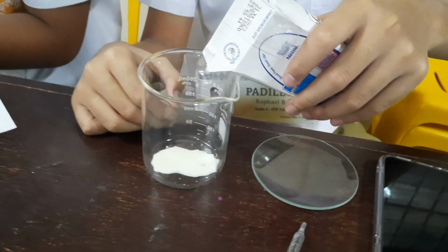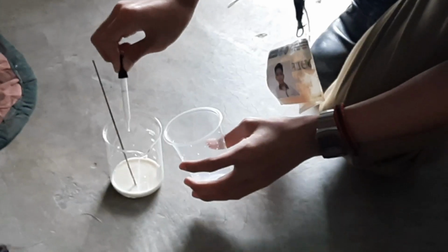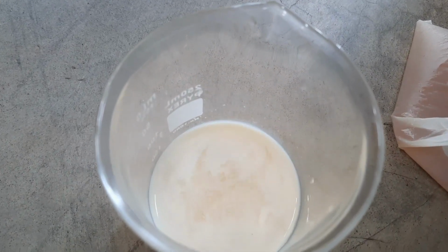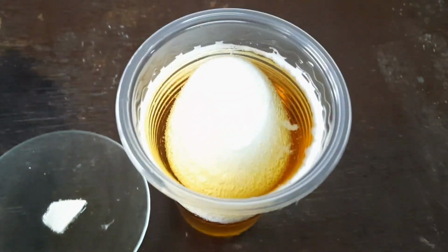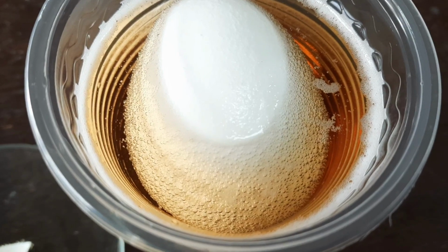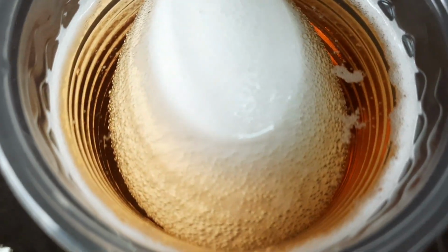Set B. Add 3 droppers full of vinegar to 25 ml of milk in a beaker. Observe the changes. For set C, add a dropper full of vinegar to a piece of eggshell in the watch glass. Soak a whole egg into the vinegar and observe what happened to the eggshell.